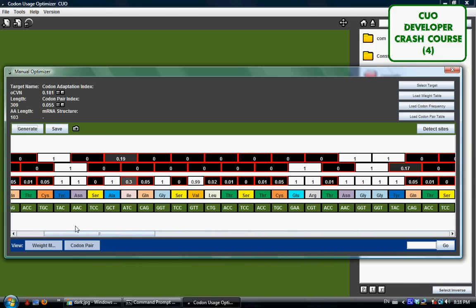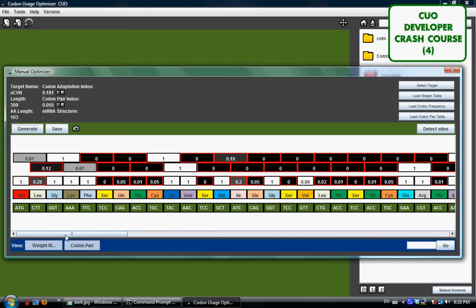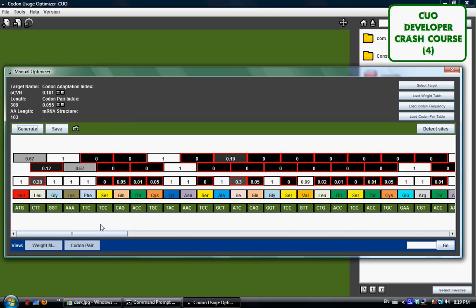0 indicates 0 occurrence. It is a normalized value, but 0 indicates absolute non-existence of that codon or codon pair in the host genome, and that is very bad. Basically the ribosome will slow down in this black box area, and the expression may not go well, or there won't be any expression at all due to the extreme starvation of the appropriate tRNA.